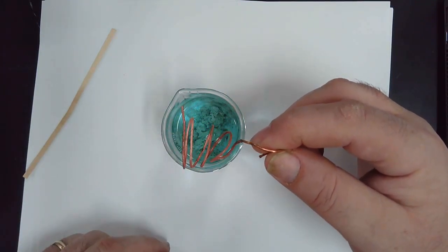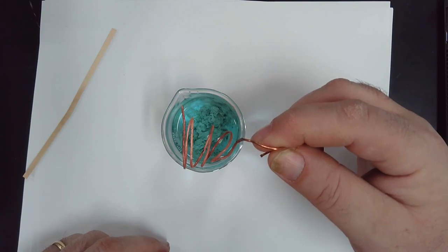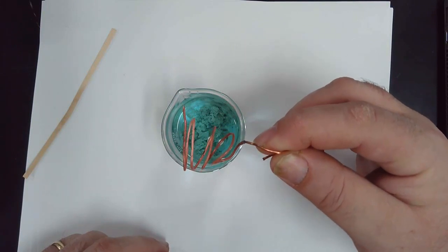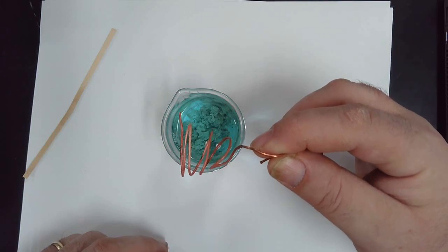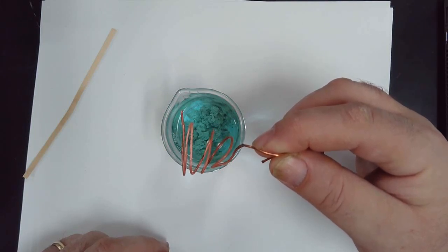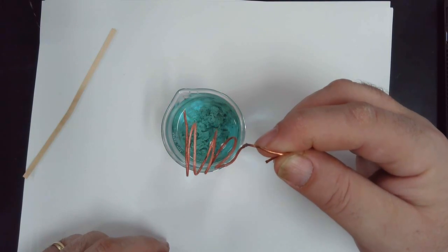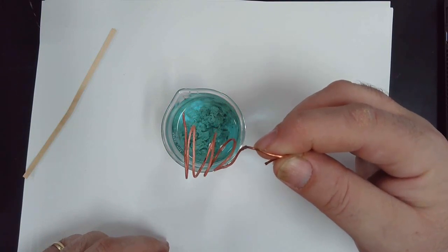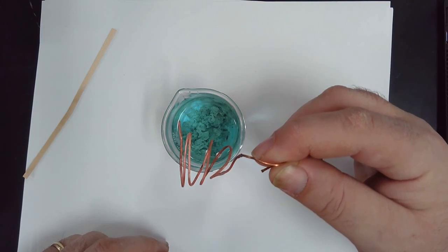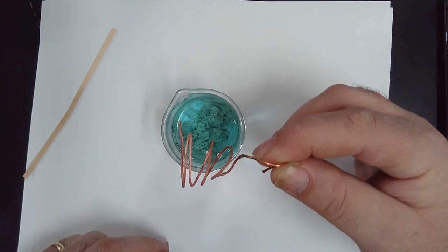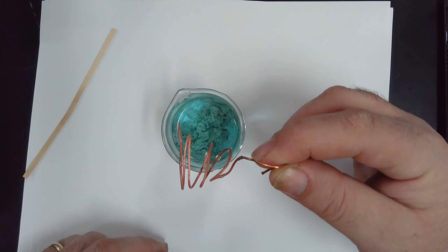You will then come to the front of the room where there is a container of acetone. Stop talking and listen please. Once you have cleaned everything off, you'll come to the front of the room, dip the copper into the acetone, and remove it from the acetone.